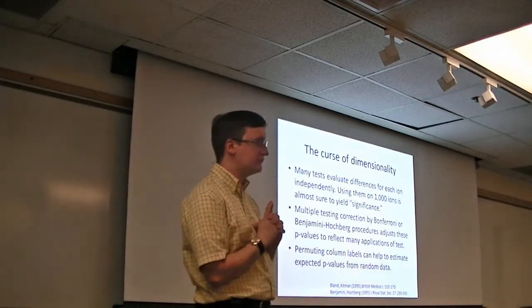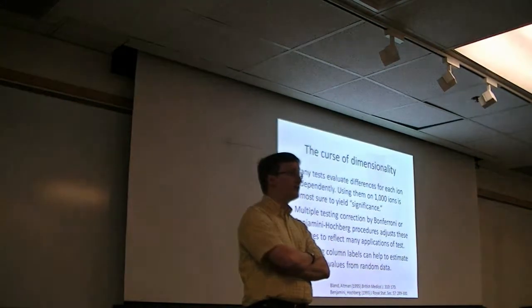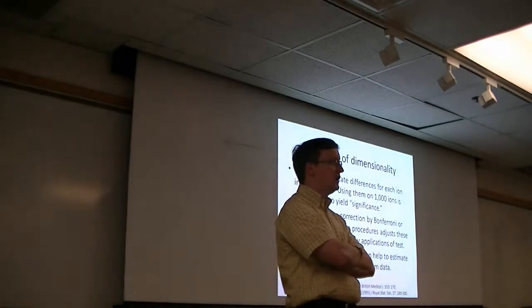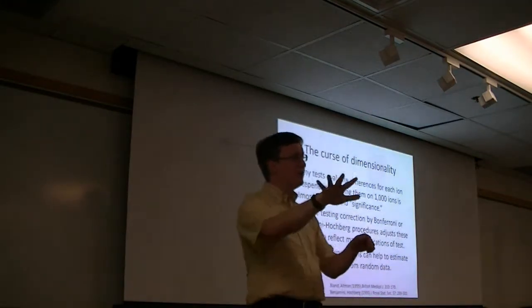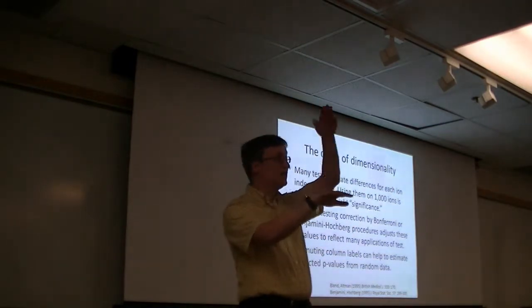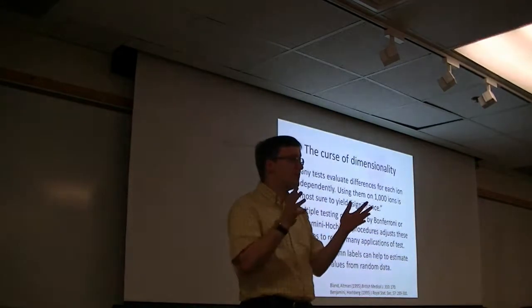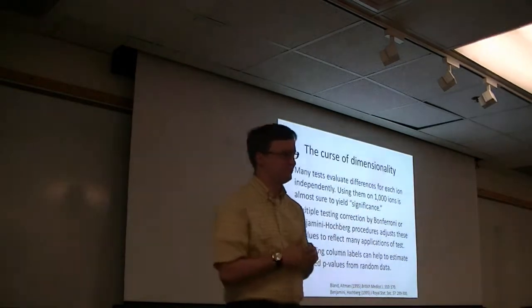So let us imagine that I have 20 different ions in my metabolomic experiment. And for each, I have some amount of intensity seen in my 5 versus 5 experiment. So 5 replicates of A, 5 replicates of B, and I have a table of 20 different species that I'm evaluating. So I might then compute a p-value, let's say by the t-test, for each of these 20 items.